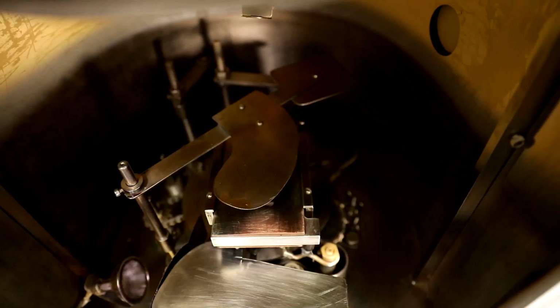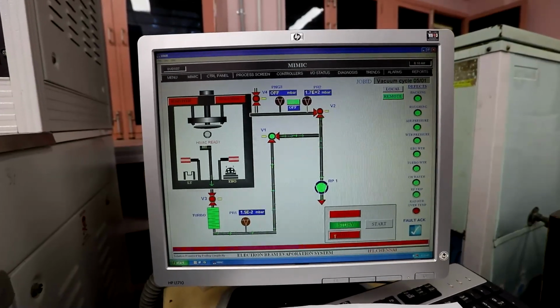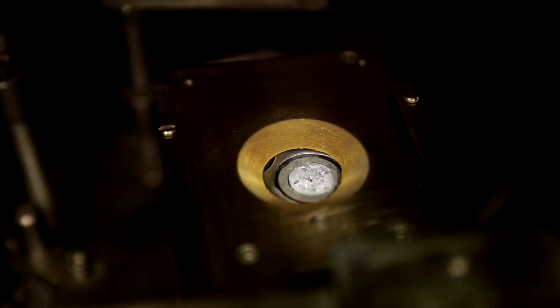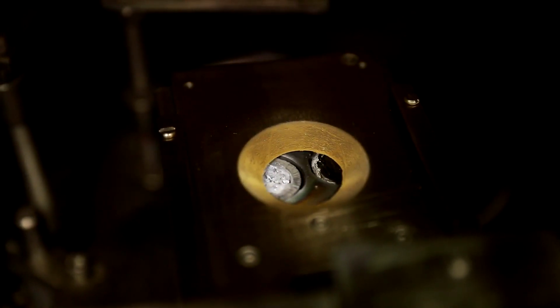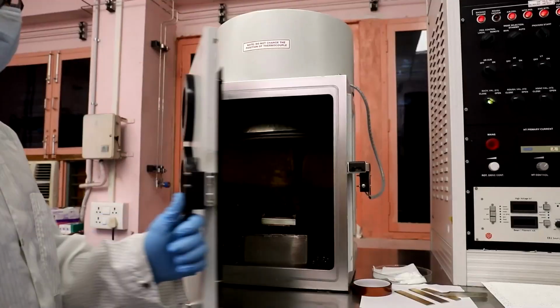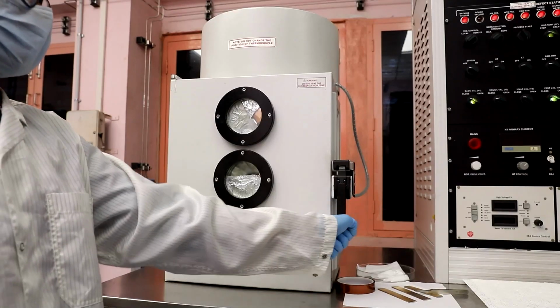We have to open the shutter in order to see the crucible. On the computer, click the process screen, then click on Shutter, which causes it to open. Here we have rotating pockets that hold the source material that can be dialed into position for different target materials to be applied to the substrate. Now close the shutter. Now close the chamber and start creating vacuum in the chamber.